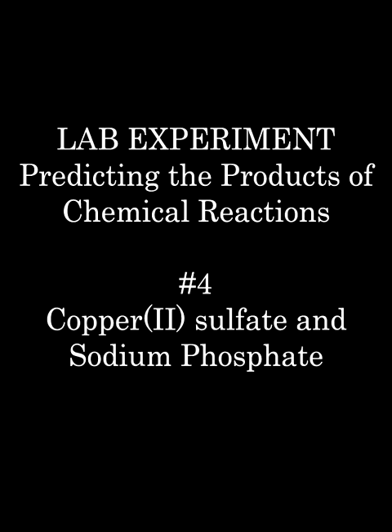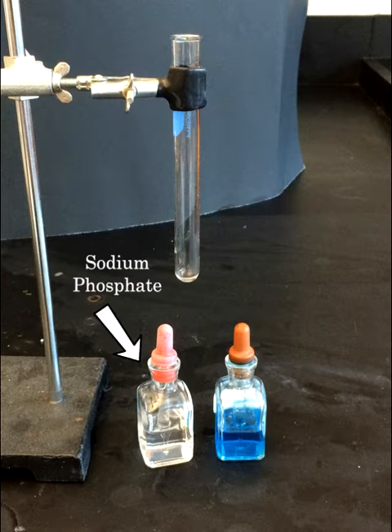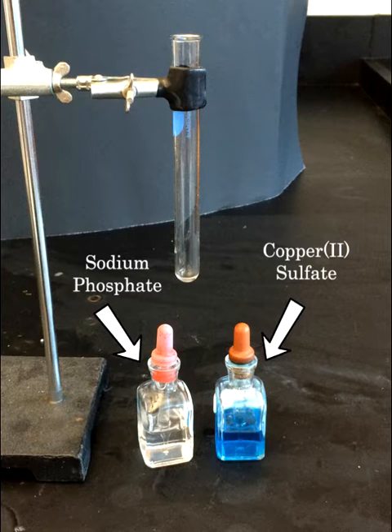Our fourth experiment will be a reaction between 1 molar solutions of copper 2 sulfate and sodium phosphate. Here are the solutions and the test tube that the reaction will be performed in. Notice that the sodium phosphate solution on the left is a clear color. Meanwhile, on the right-hand side, the copper 2 sulfate solution is blue, yet it is still transparent.